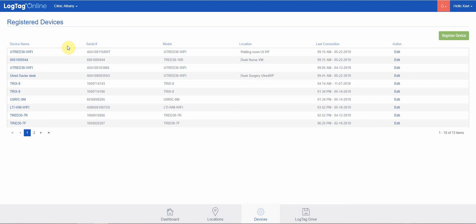For real-time devices, you need to register that device to receive temperature information in real-time. For standard or traditional loggers such as the TRIX-8, you need to register that device to see if it's associated with your account, or it becomes automatically registered when you download data from that logger.